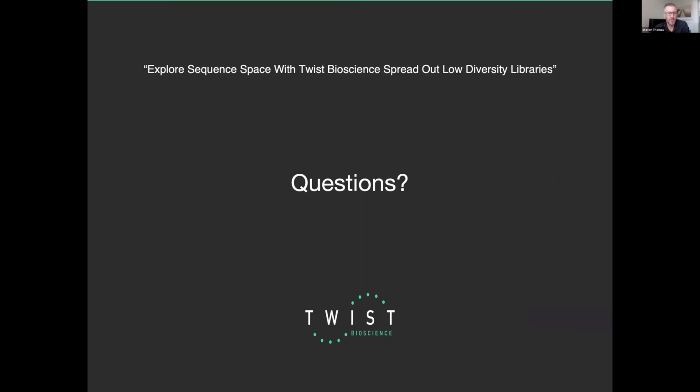There's a few questions along the theme of, I'll just try to paraphrase what they say, the size limitation. If they wanted to go maybe a little bit beyond 1 KB, how feasible would that be? I mean, we can definitely work with you to try it. We've built a few libraries that are 100 base pairs over, and a couple that I think are maybe slightly 200 base pairs over. We can be flexible. So again, it really depends on the design. But if you're going from 1 KB to 2 KB, then probably not at this point right now. But if it's just a few hundred base pairs outside of that, I think that should be doable.